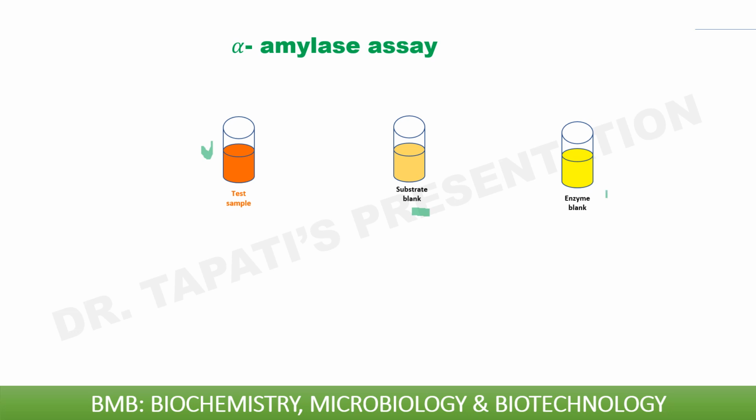In case of extracellular microbial α-Amylase, you may get sugar content in the crude extract. So we are taking this enzyme blank value where only the enzyme sample is present. We have to measure the maltose content in the enzyme sample.